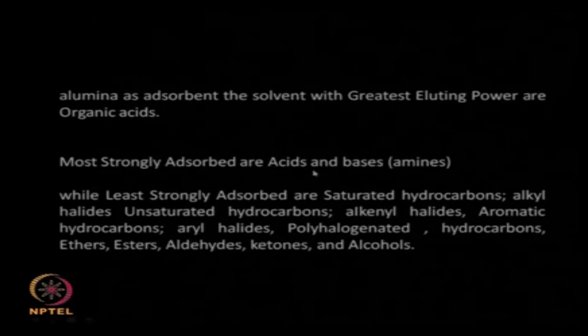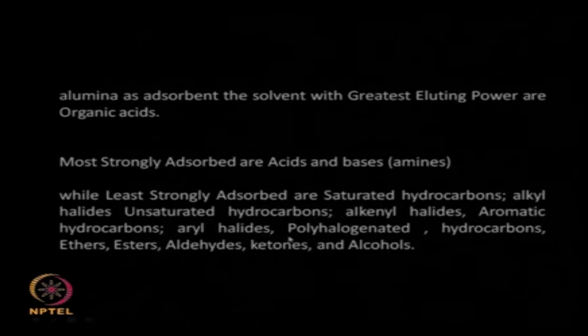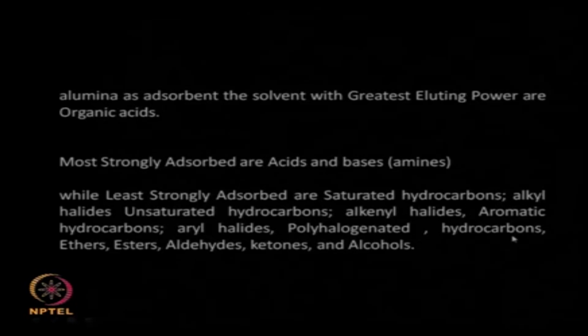So most strongly adsorbed are acids and bases, while least strongly adsorbed are saturated hydrocarbons, alkyl halides, unsaturated hydrocarbons, alkene halides, aromatic hydrocarbons like aryl halides, polyhalogenated hydrocarbons, ethers, esters, aldehydes, ketones, and alcohols.